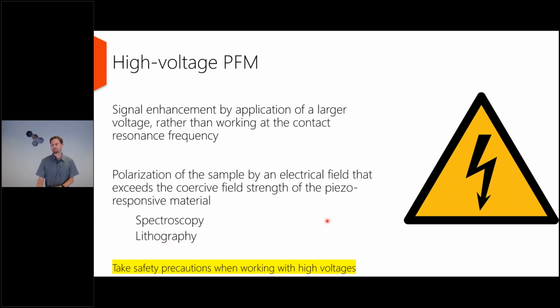Of course, if you implement high voltage PFM on your own instrument, take care, particularly if you're working with high voltage amplifiers that can apply also high frequencies. You have to take safety precautions for yourself, but also for your equipment, that you don't burn, that you don't get any injuries.